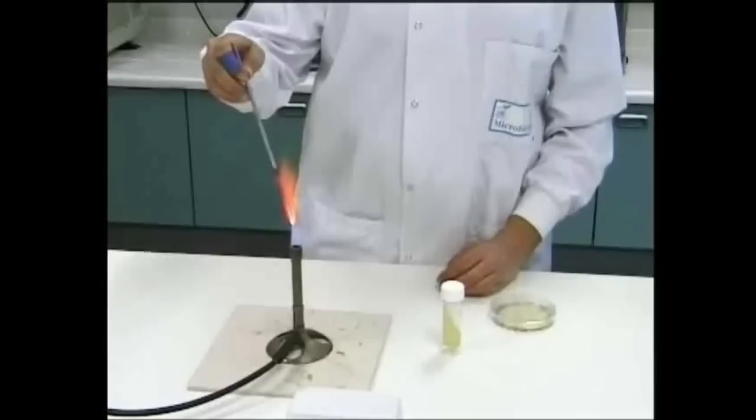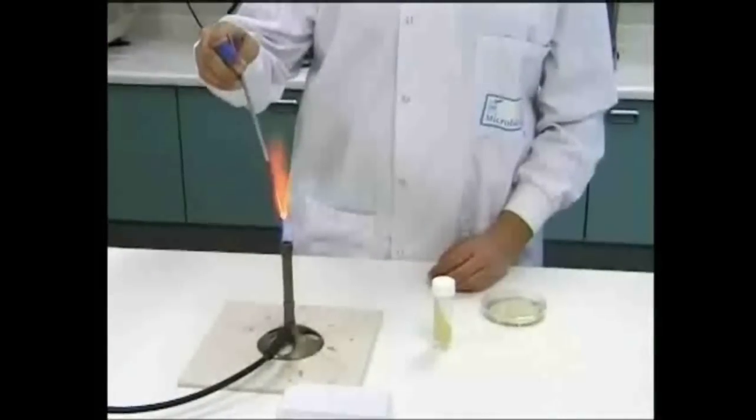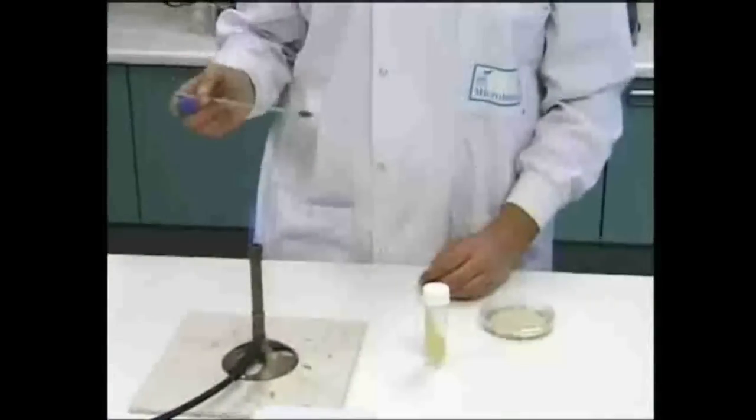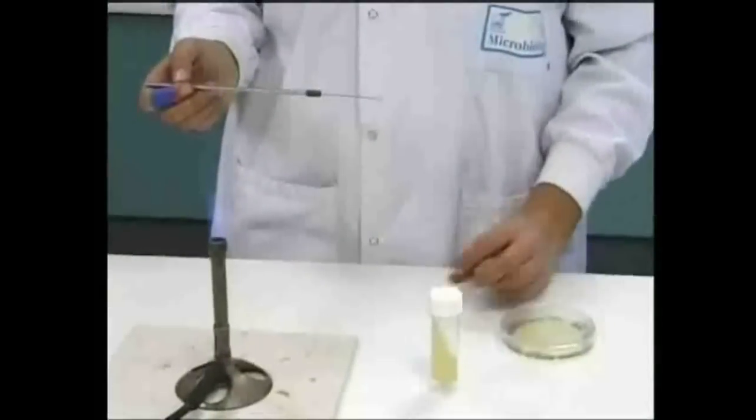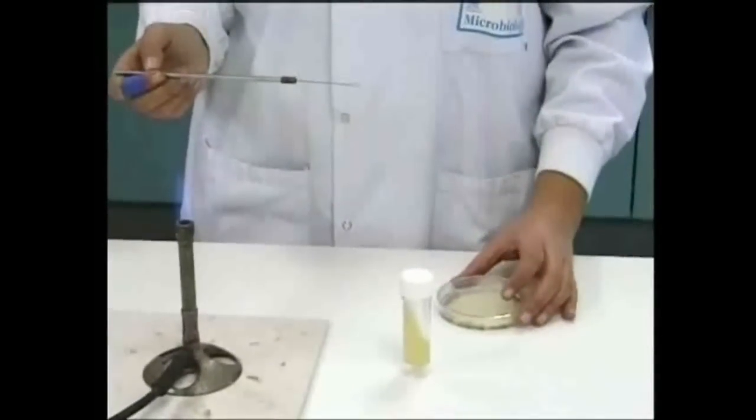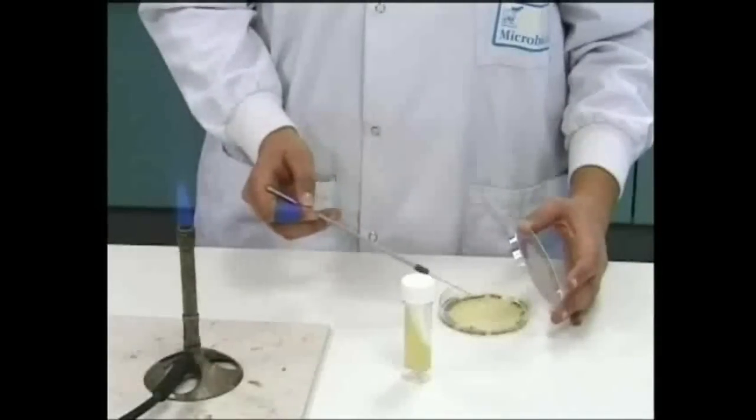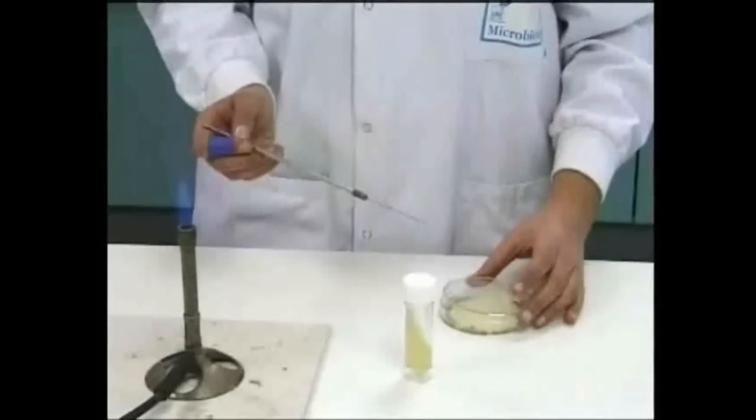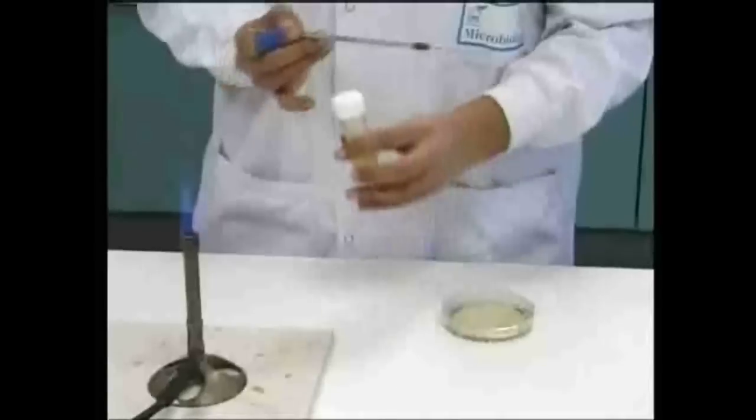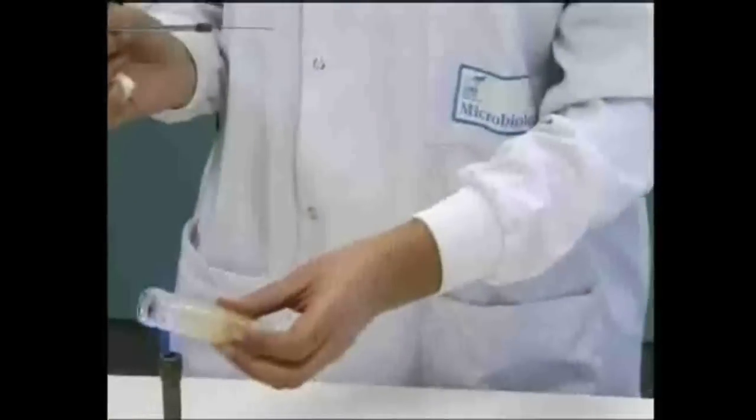Slopes are usually inoculated using a wire loop. The loop is flamed and allowed to cool before one well-isolated colony is picked up.